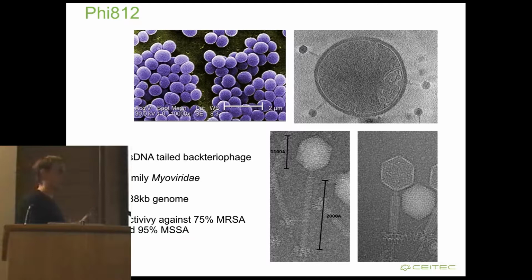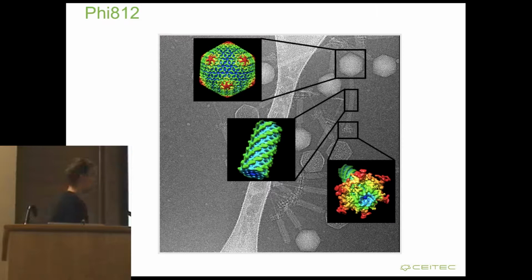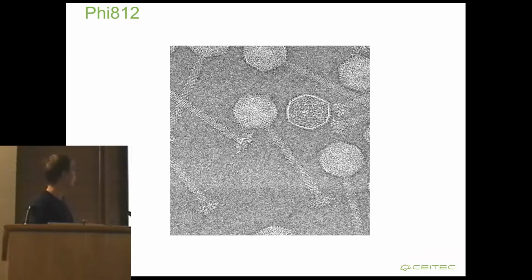And our aim at this stage as an electron microscopist and a structural biologist was to characterize structurally the phage in its native form and the form after it infects the cell, which we call a contracted form. So we use cryo-electron microscopy to do that, and also use what we call a divide and conquer approach. So in order to learn about individual parts of the phage, we determine multiple structures of its individual parts. And let me see if the video works.